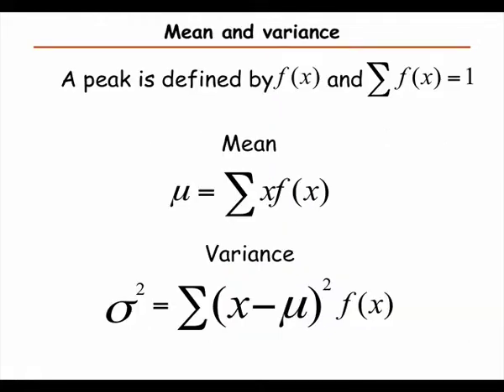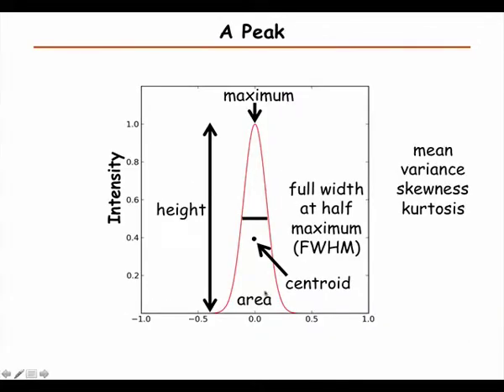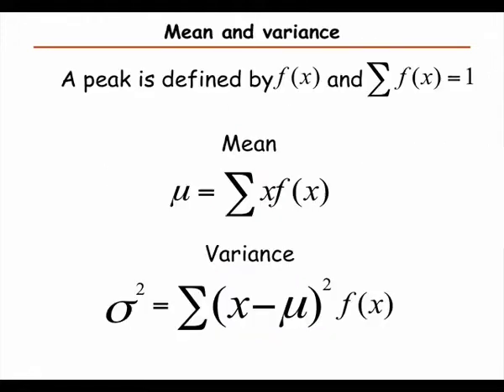And what was the x-axis there? Sorry. So the x-axis is, in this case, undefined, but in mass spectrometry, it would be mass to charge. But in the general case, for ChIP-seq, it could be genomic coordinate, it could be all sorts of things. For example, if we look at an image and we cut a straight line through it, it could be distance. But for us, it's going to be mass divided by charge.